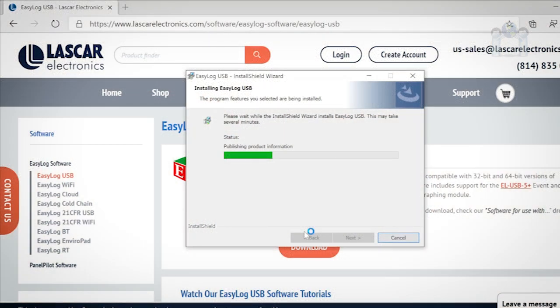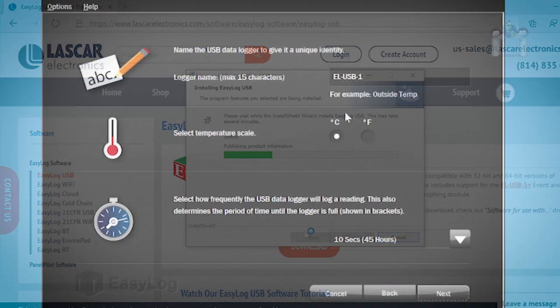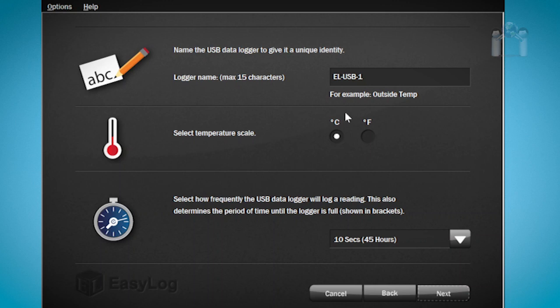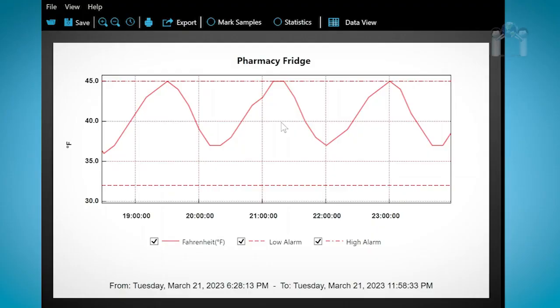Now, let me demonstrate how to install the EasyLog software. This software is necessary for you to use your data logger. It is used to configure the logger, download the data, read the data, as well as perform other functions.